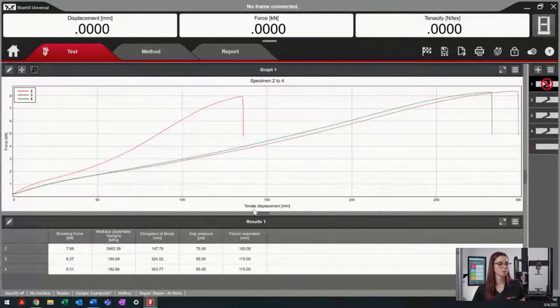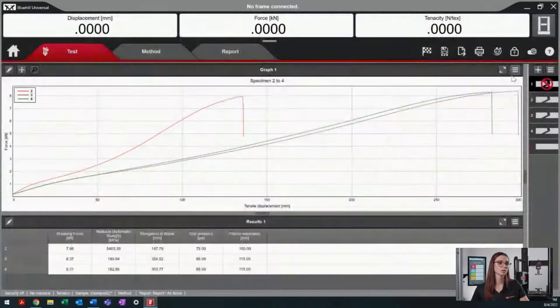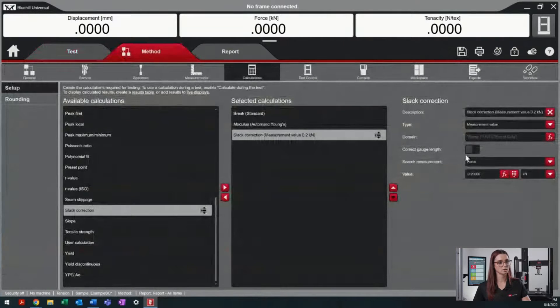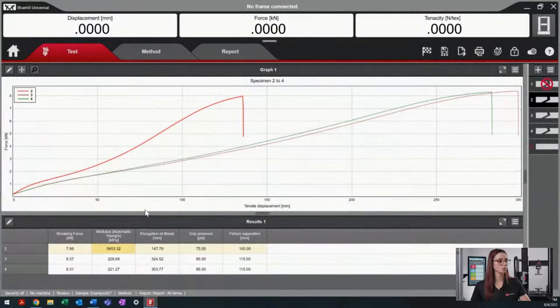As mentioned earlier, it's very important to use an x-axis of tensile displacement. As we saw earlier, with the displacement as the x-axis, the graph does not update with the slack correction calculation. Another thing to notice is that our results section is not updated unless we toggle on our correct gauge length. So now that we do that, our results section will update using the new gauge length after the slack correction has been implemented.